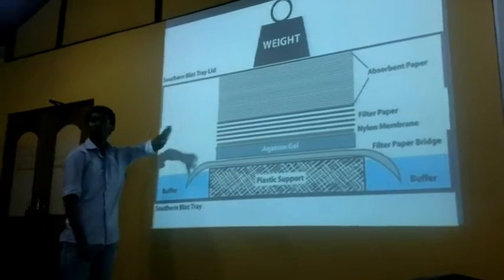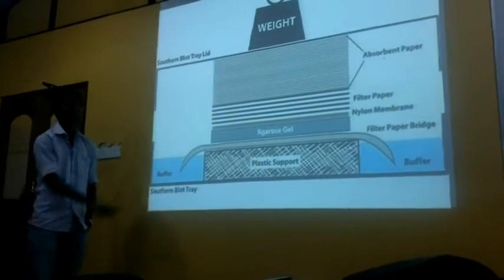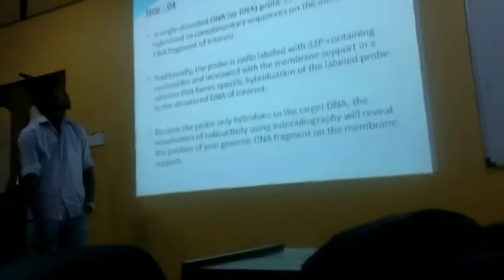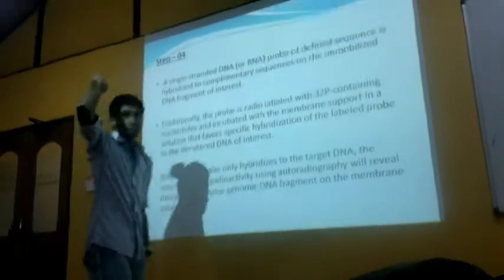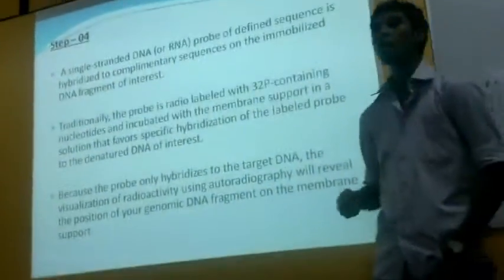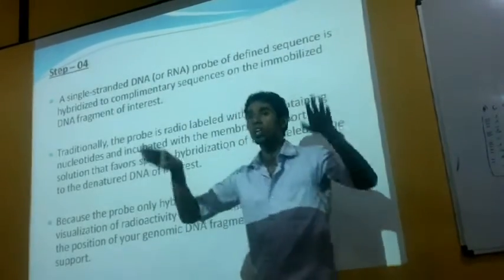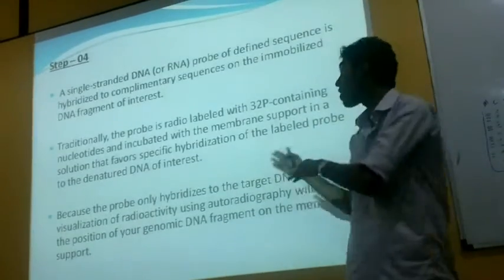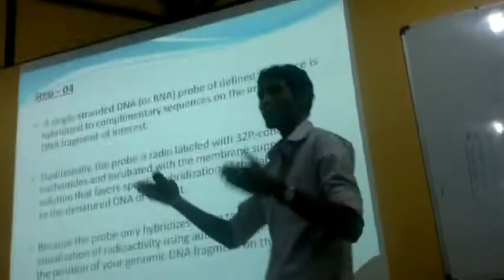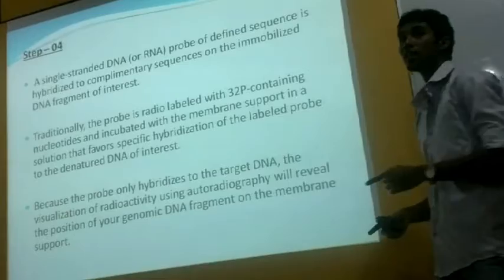This is done for quite a period of time so that almost all the DNA fragments you have in the gel are bound onto this. Understand how this procedure happens. Fourth step, a very important step, the hybridization step. Anish explained what hybridization is. Now you have all the DNA fragments on the nitrocellulose layer of the nylon membrane. We don't have anything in the gel; everything is taken onto the nylon membrane or nitrocellulose membrane. Before that, I'll just tell you what you mean by hybridization.